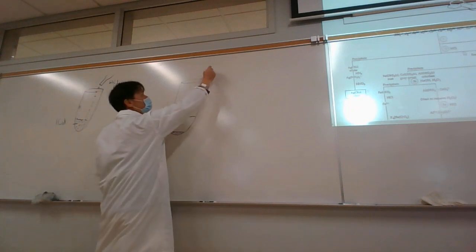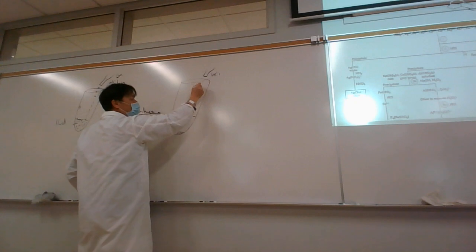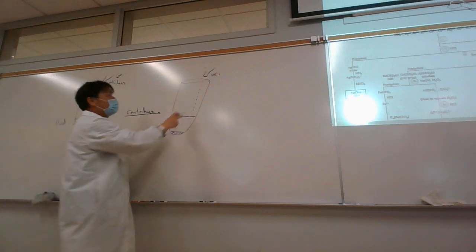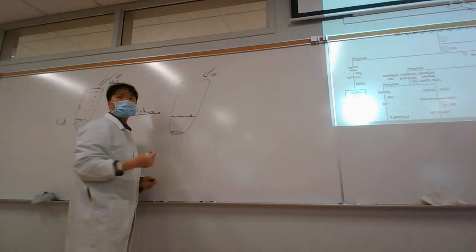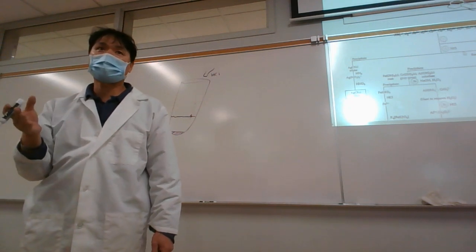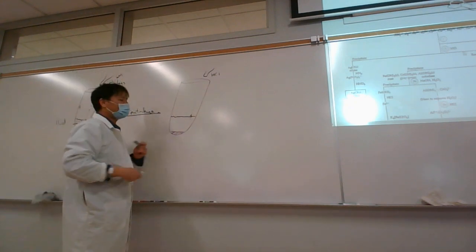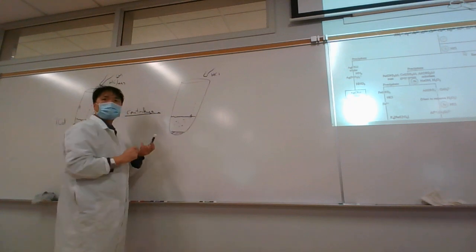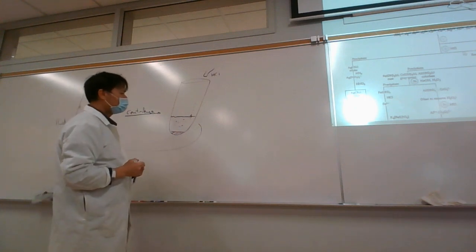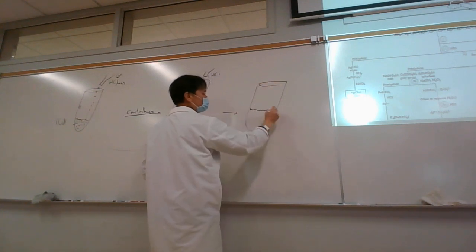And then we'll continue adding HCl. As we continue adding HCl here, we're looking for additional cloud formation, so we'll just add 1 drop. If we add 1 drop, and we have more precipitate, then we're going to keep adding, and keep adding until it stops precipitating or we can't tell. Let's say it clouds up again. If it clouds up, we haven't added enough. So we're going to repeat this until when we add 1 drop, no precipitate forms.